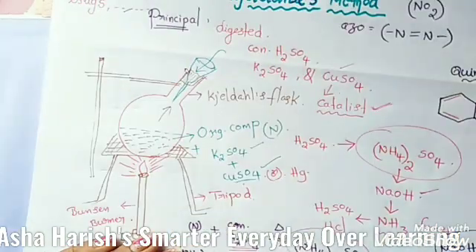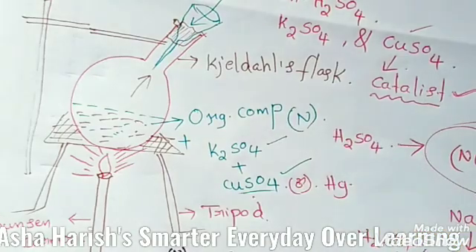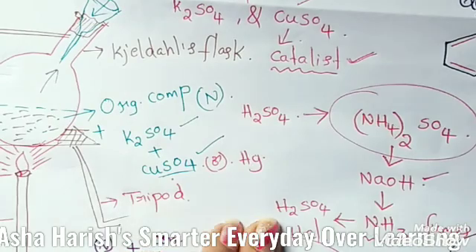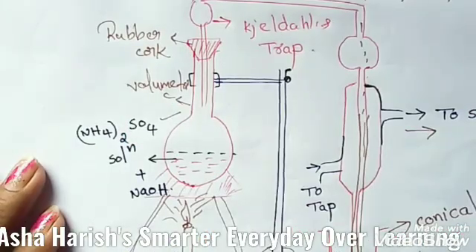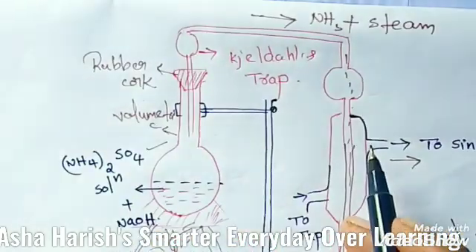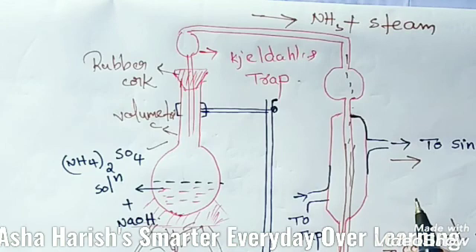Here, that is the digestion process or heating process, you can see in this diagram. Now after, here is the conversion of ammonium sulfate takes place, and after this diagram we have to see the formed ammonium sulfate is going to treat with NaOH. Here is the diagram, treating with NaOH, then NH3 fumes will come, and this NH3 is treating with again H2SO4. Now (NH4)2SO4 will form. Okay, now let's see the calculations.